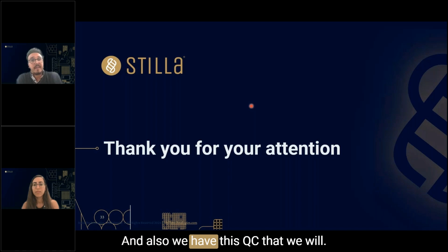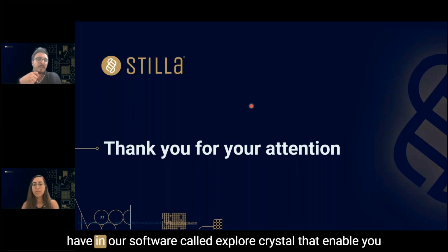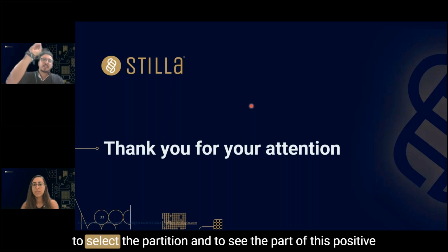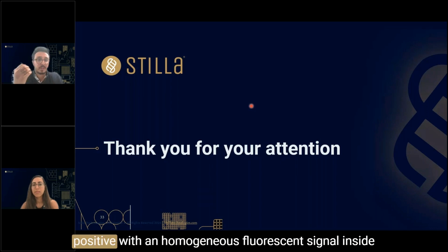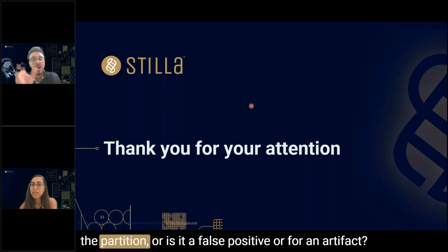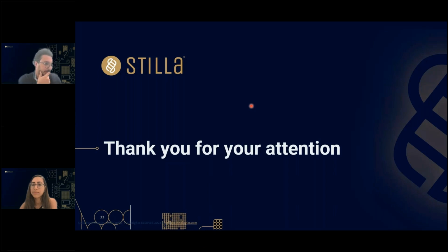And also we have this QC that we are able to see using the feature that we have in our software called Explore Crystal, that enables you to select the partition and to see this positive partition inside the QC image, and to see if it's a true positive with a homogeneous fluorescent signal inside the partition, or is it a false positive or an artifact. So this is another way.